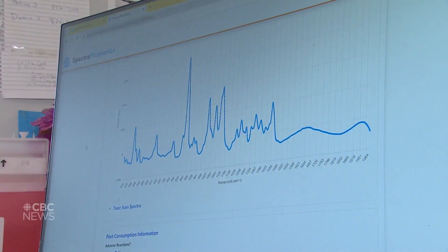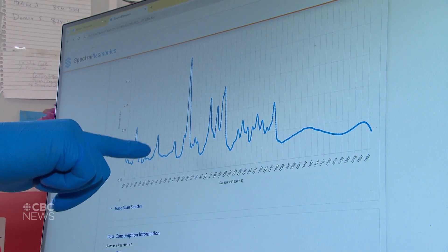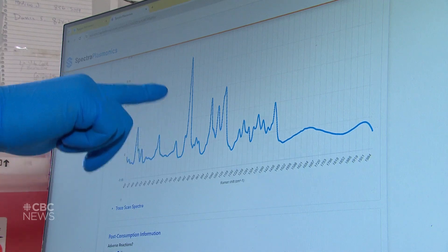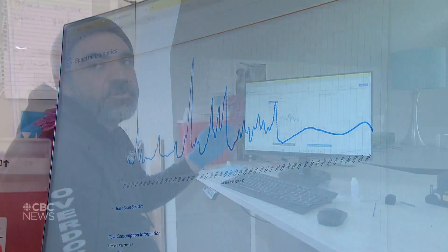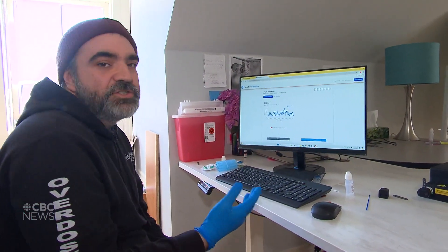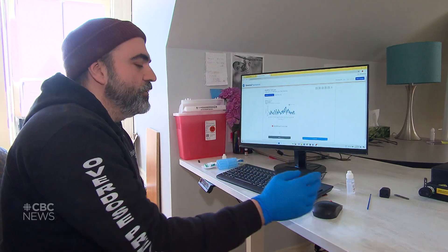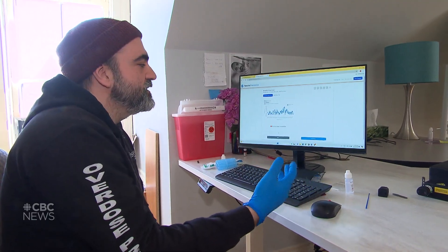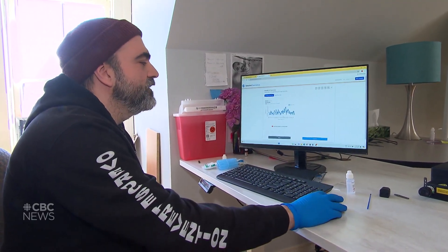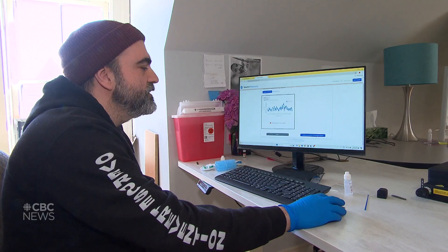In this instance it wasn't able to get a good quality scan, so it's going to go back to a reach-back support that we have with the company. A drug technician is going to take a look at it and let us know what the results may be, and that can take 24 to 48 hours.